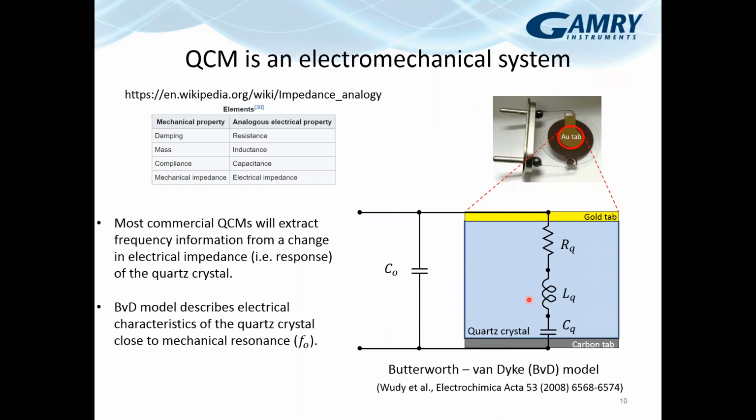And with that, you can start to look at the L and the C. And what happens is you'll notice that we have an L and a C in series, and we have an L and a C in parallel. So what is the consequence of having these two basically resonances?